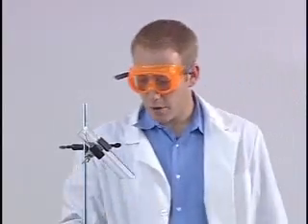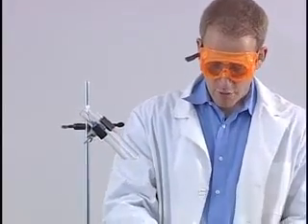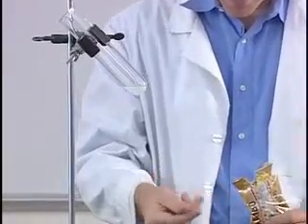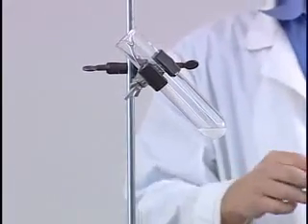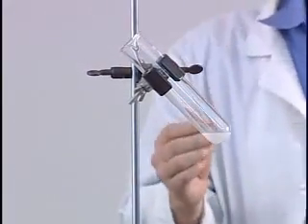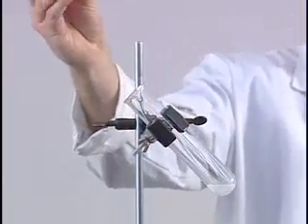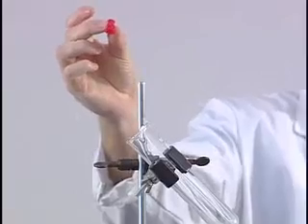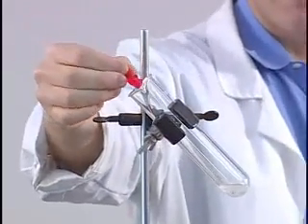The reason I'm heating it is also that it needs to be liquefied. This potassium chlorate is now in the liquid form. So I'm going to take a gummy bear, and it could be a red gummy bear, a green gummy bear, a yellow gummy bear, an orange gummy bear. It doesn't matter. I just need a gummy bear that I'm going to put into the solution, and you're going to see the bonds of glucose react. So here I go. I have a red gummy bear, just for fun, because red is a good color. I'm going to drop it in, and you're going to watch what happens.